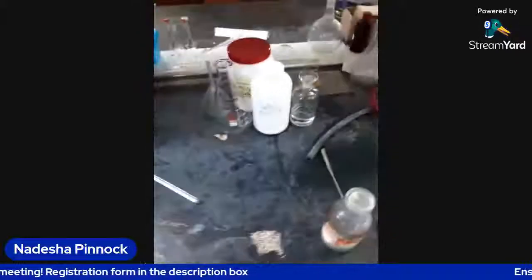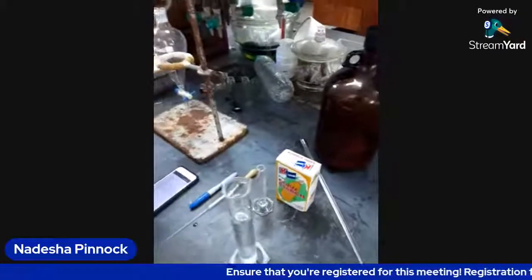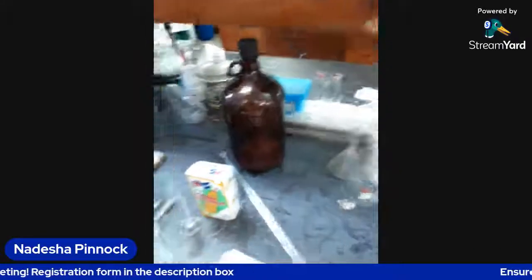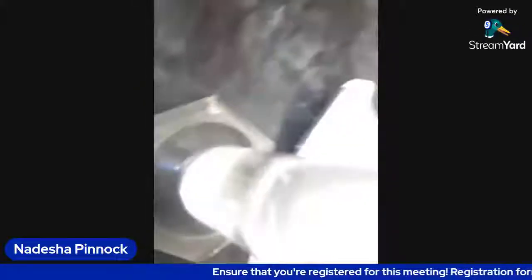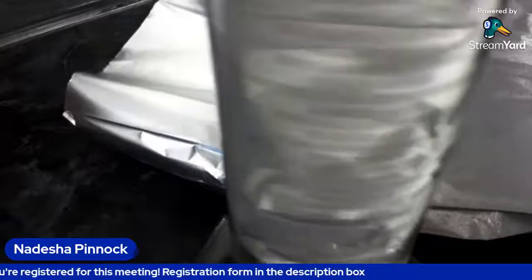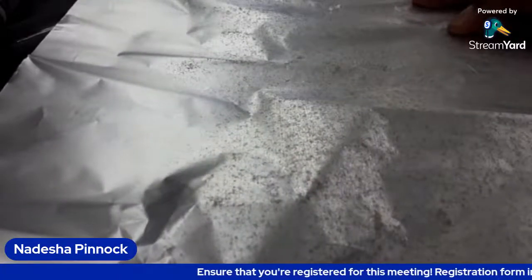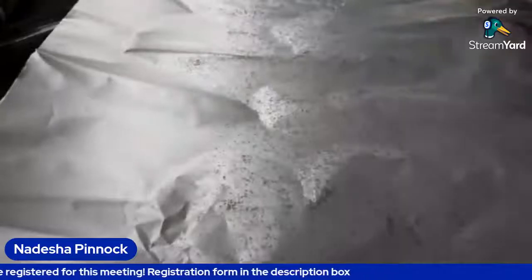We would take it out and put it on an aluminum sheet. Smells like glue. Javon says it smells like glue. So I bought some aluminum foil to spread it on. Let me just break the foil. So remember what we want is a thick, opaque solution. Well, not a solution, it's supposed to be thick. Let's put it on the foil.